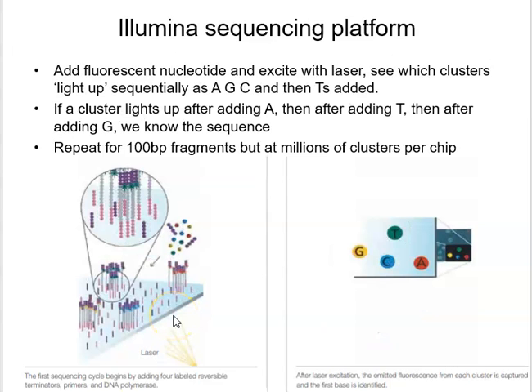And we can then do some other steps where we cleave off one of these sequences, but we can start then adding in our nucleotides and primers and look for flashes of light when we add in a G, C, T or A on a localized area. Okay, now with that bit of basic knowledge, it's probably now a good idea to watch the Illumina video start to finish and keep referring back to what I've just said to try to understand what the video is doing so you're not immediately confused.